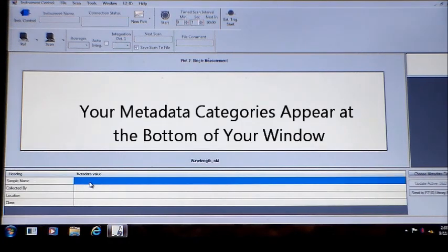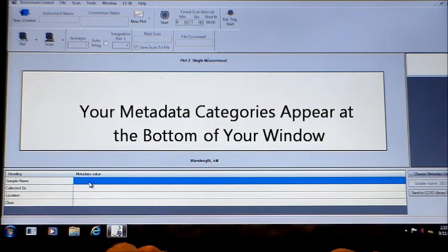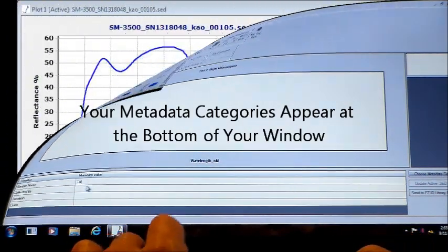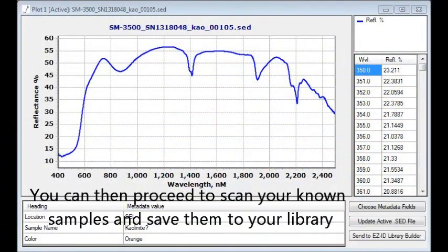Save the categories you have selected and they will appear at the bottom of your EasyID window. Scan your samples and save them.